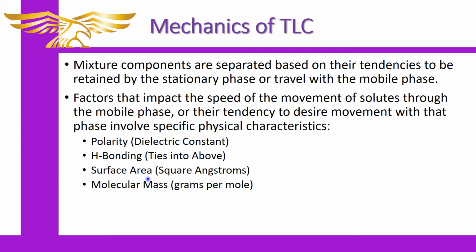And of course, if something has more hydrogen bonding than not, then something that's capable of hydrogen bonding will probably be better at working with it. So those are just some ideas to keep in mind. Now, you can get a little more physical with the measurement if you want to, and you can do the dielectric constant. And there are studies that have been done on TLCs and dielectric constants, trying to determine a rubric of solvents to use based on dielectrics.